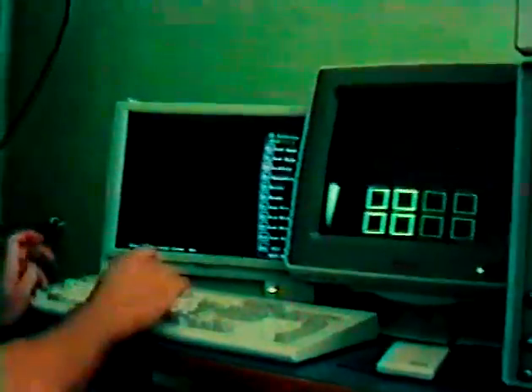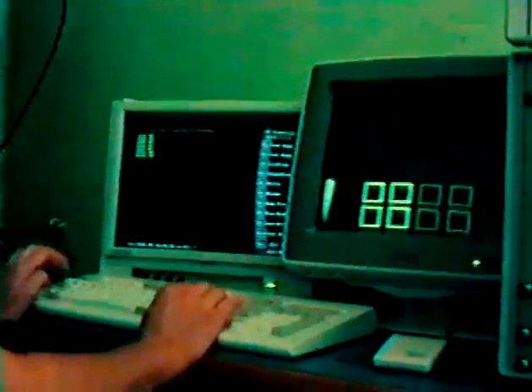Please have a seat here. And what do you deal with? What kind of apparatus do you have yourself? We have more reactor systems at higher pressures. We have XPS, Auger. They're building an STM, but it's not operating yet.